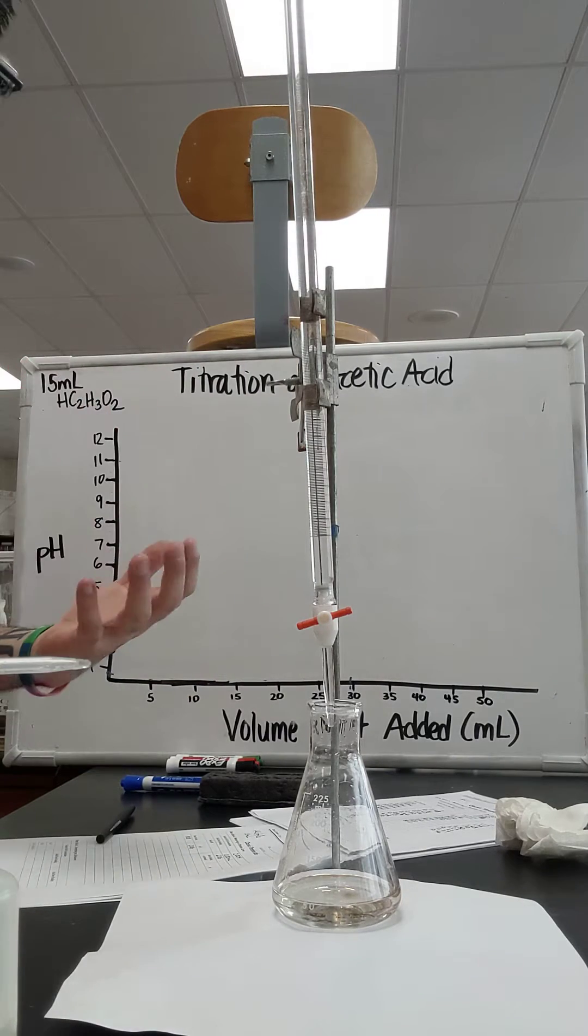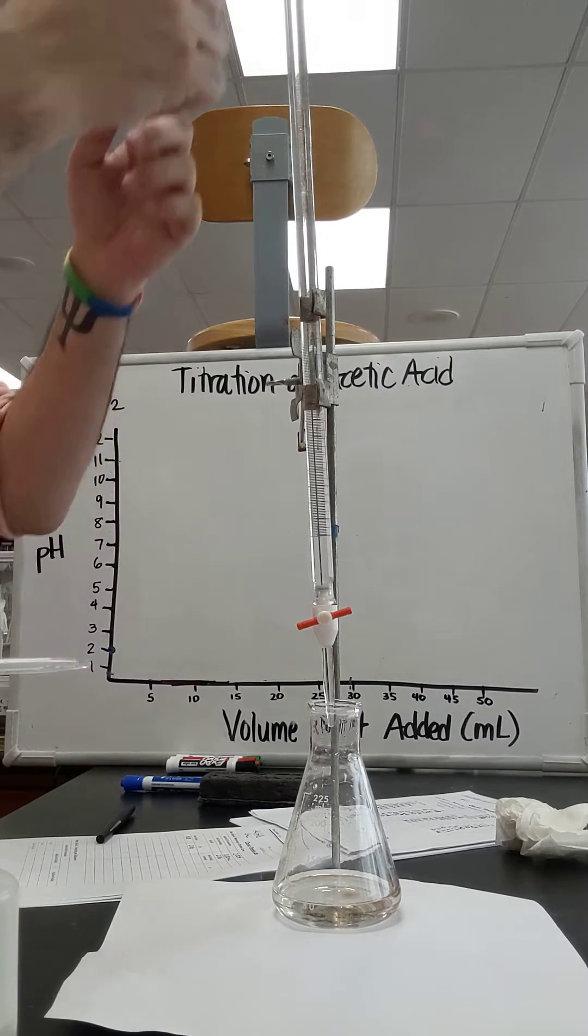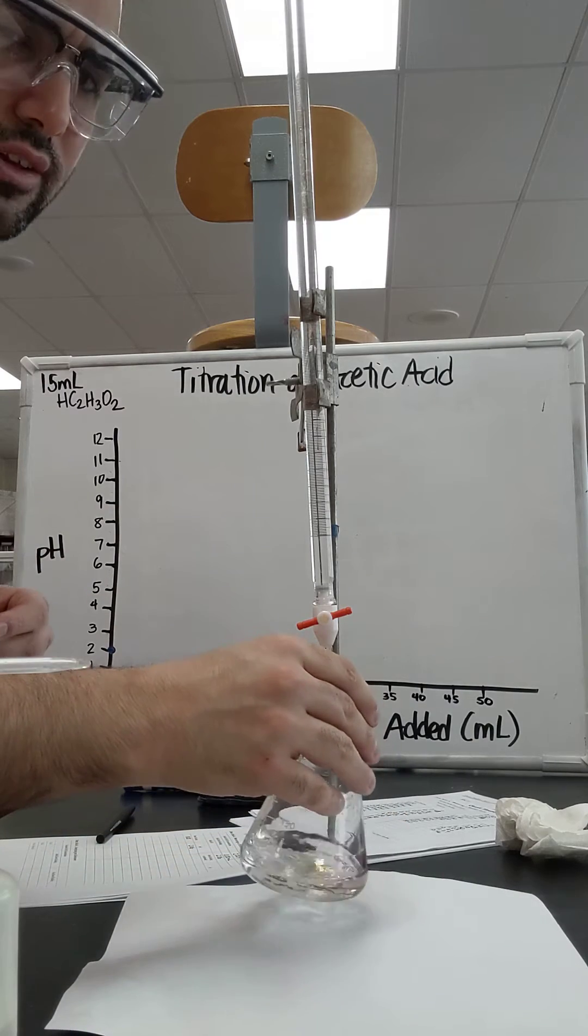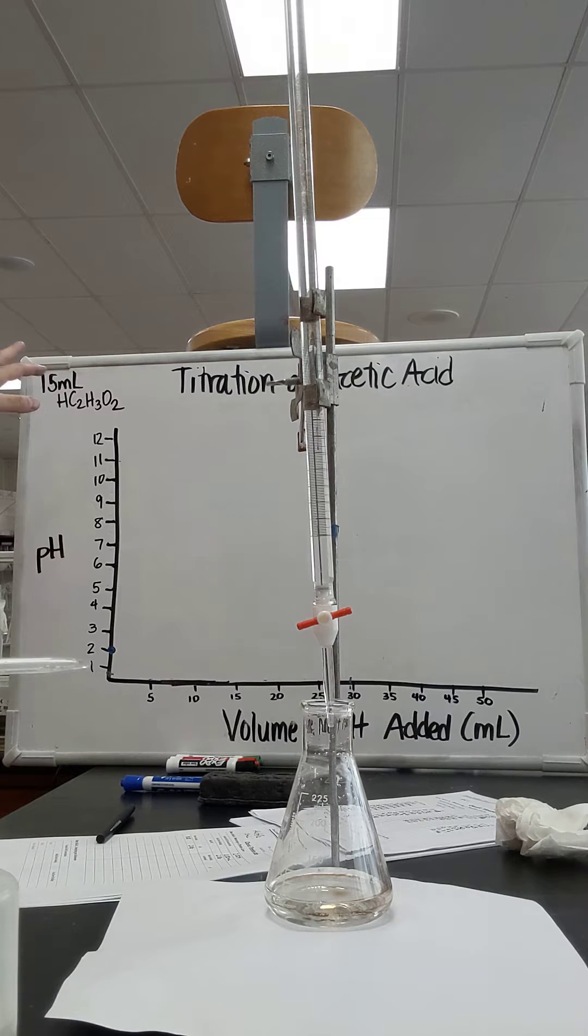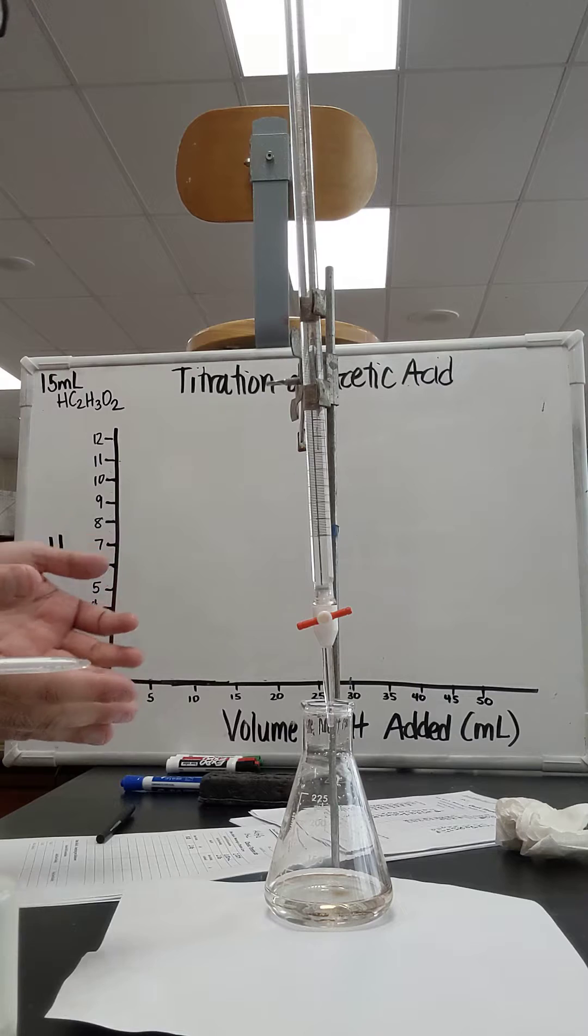Alright, hey AP Chemistry. Now I'm doing a titration of acetic acid in here, which is a weak acid, with 2 molar sodium hydroxide. I don't know the concentration of acetic acid, but you could use titrations to figure that out.